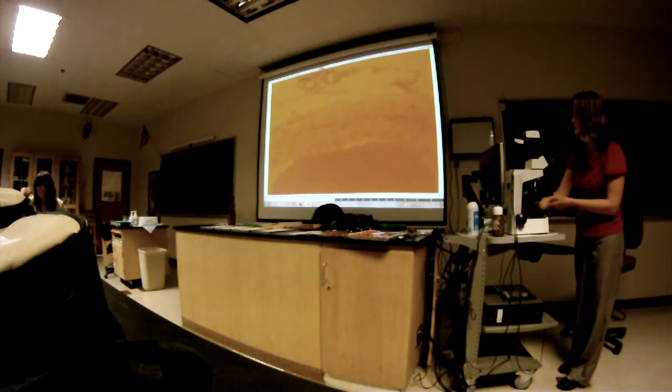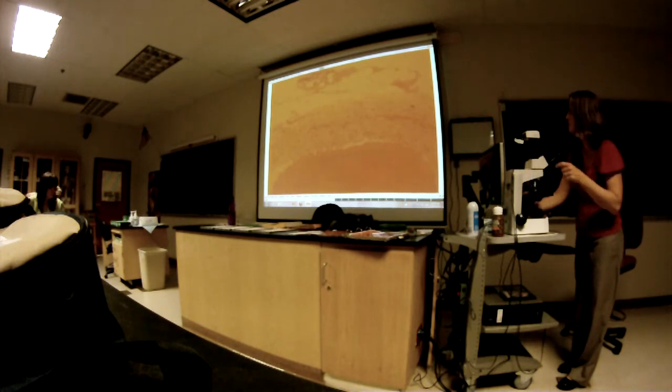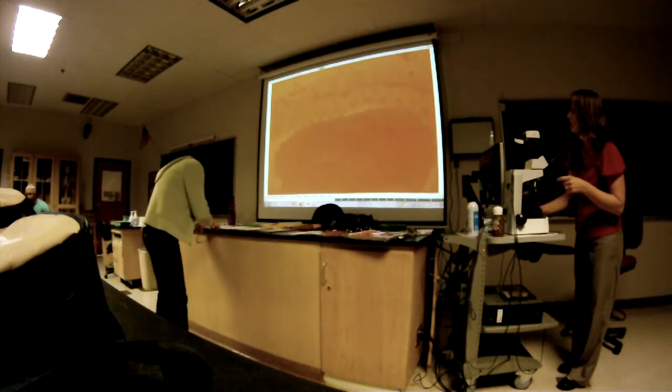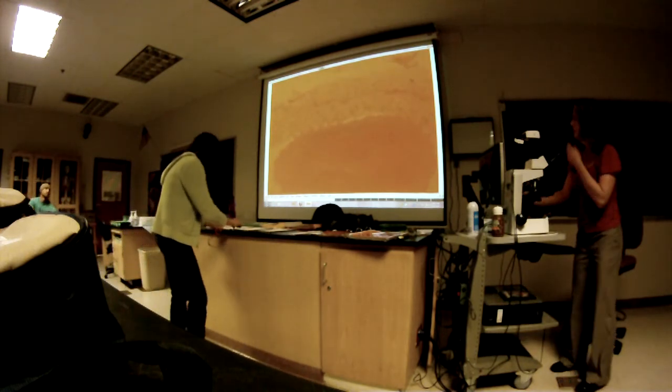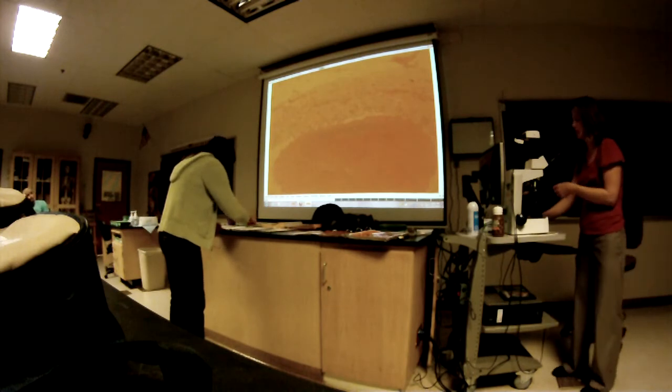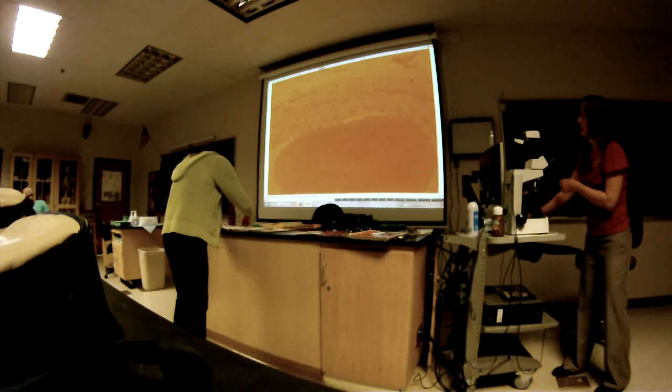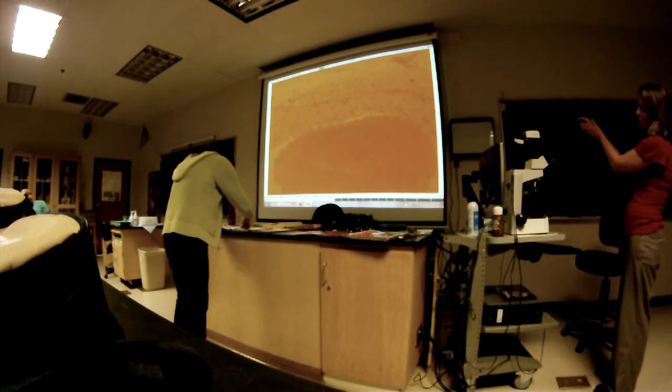Can you get another F23L? I know we have a better, oh, it's right here on the front, sorry. My bad, I'll get it. Oh, thanks. Okay, let's look at this one, and then if we have time, we'll look at another one, because the other one we have is a little bit better than this. And I know the coloring isn't great tonight, but we will get a little bit better.